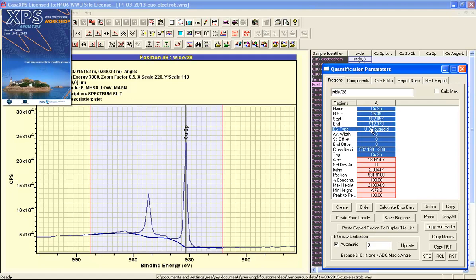Finally, after a region such as this has been created, the next thing you would do is add further regions. Then, once the regions are defined, start to assess whether the intensity calibration in terms of transmission function, escape depth, and angular distribution are all correct for these particular data.